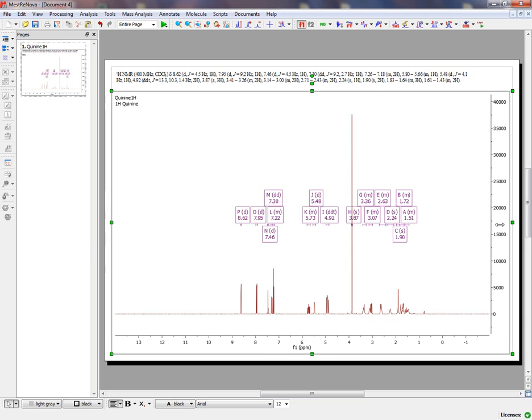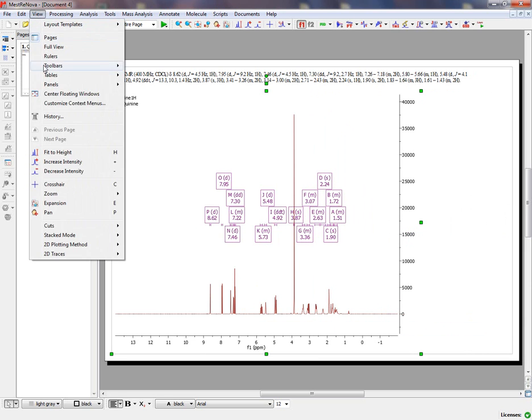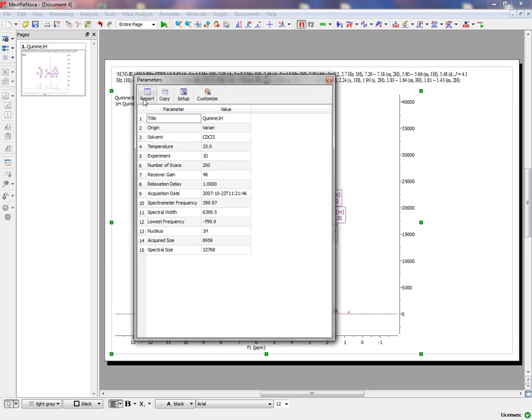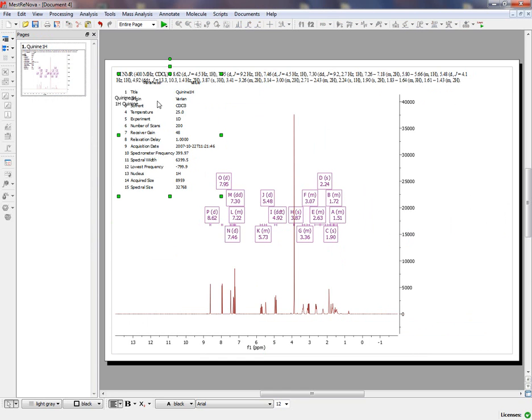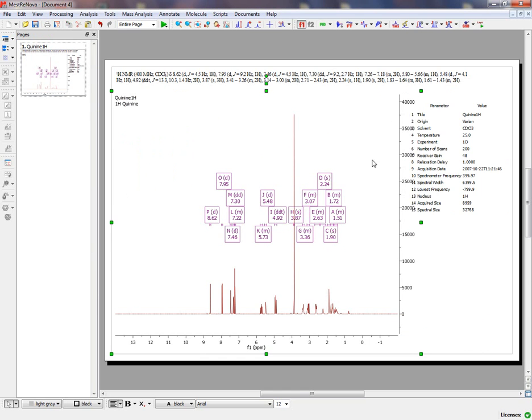You may be interested in showing the parameters table just by following the menu View, Tables, Parameters, and clicking on Report to paste the parameters table to your spectrum.